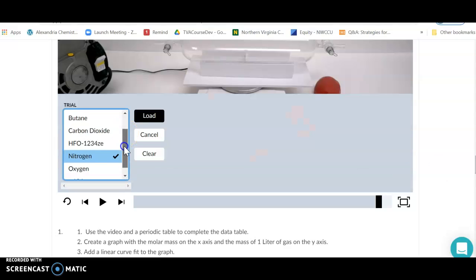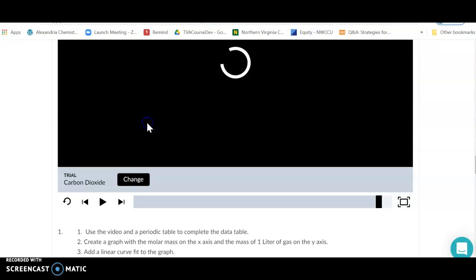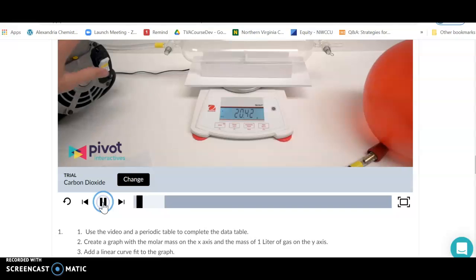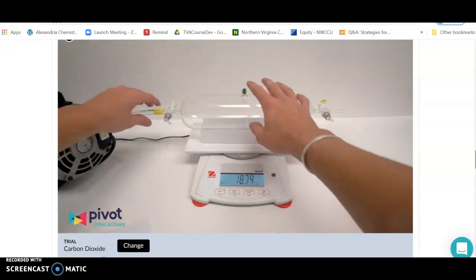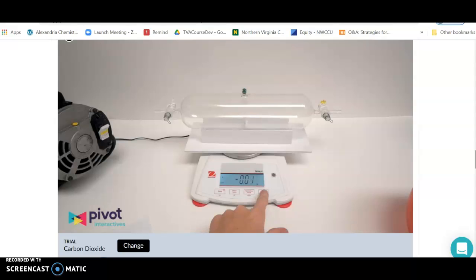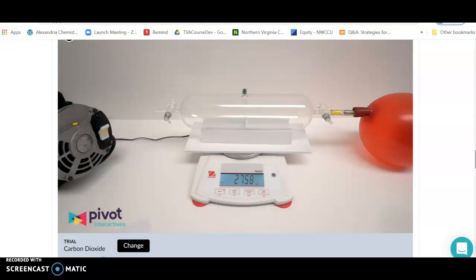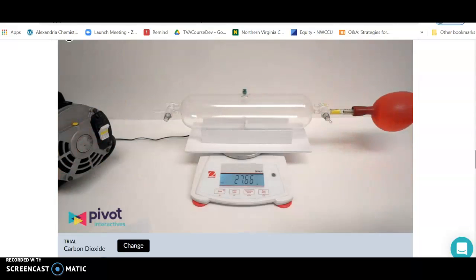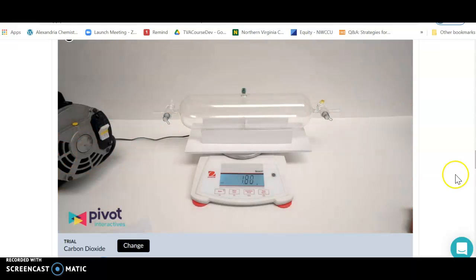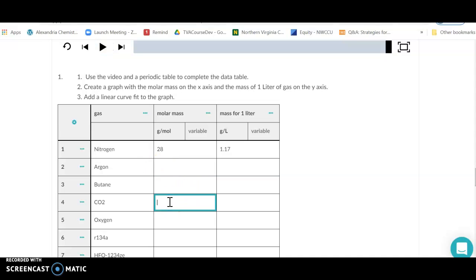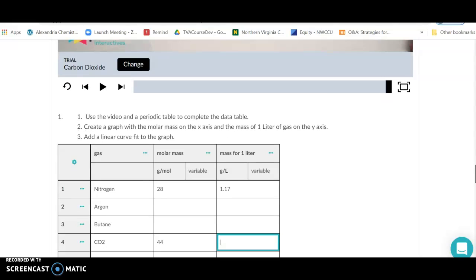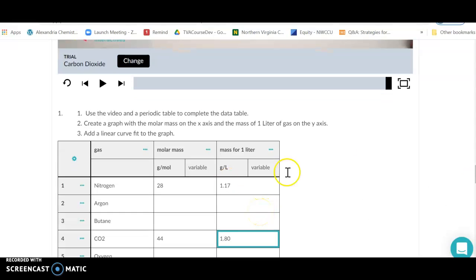Next we change gases — I'm picking carbon dioxide. We evacuate the container, take the air out, close it off, set the mass equal to zero, hook up carbon dioxide, push it in, open the left side so pressure balances to 1 atm, then weigh it. The mass of carbon dioxide comes out to 1.80 grams. CO2 has a molar mass of 44 grams per mole and a mass of 1.80 grams for one liter.